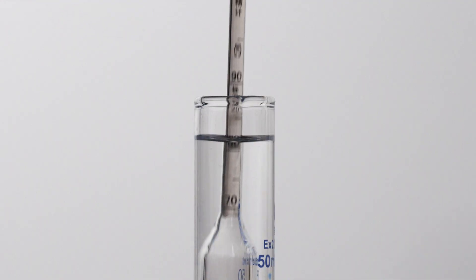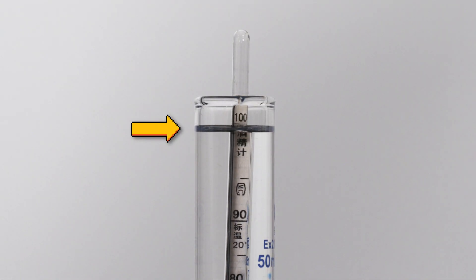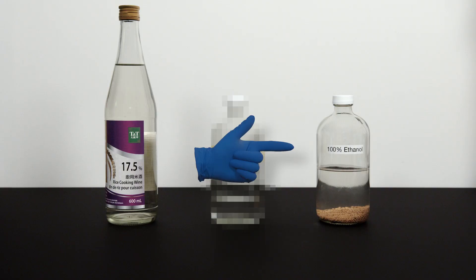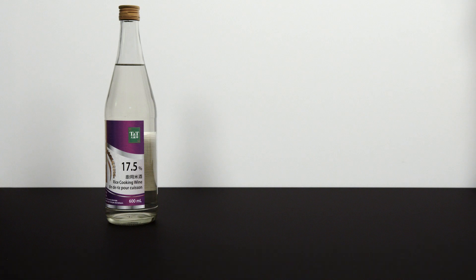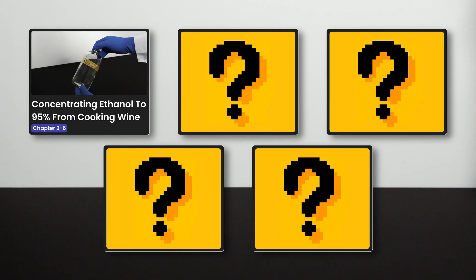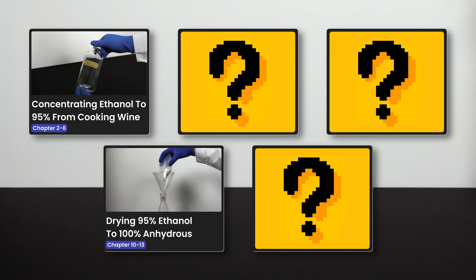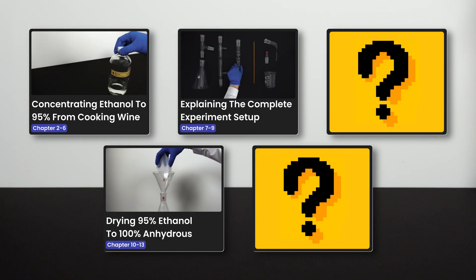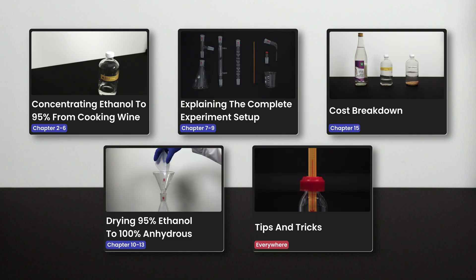This is the ethanol hydrometer. If it reads exactly 100, that means we are getting 100% ethanol. Today, you will learn exactly how to make 100% ethanol using only cooking wine and a drying agent we made previously in another video. In this video, I will go over the steps of concentrating ethanol to 95% from cooking wine, drying 95% ethanol to 100%, explaining the complete experiment setup, tips and tricks, and covering the cost breakdown.